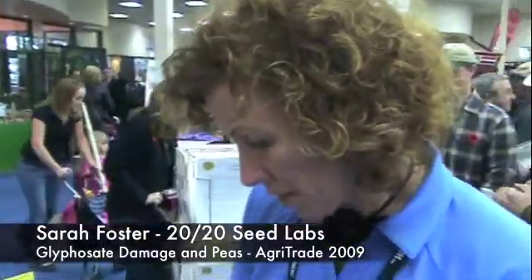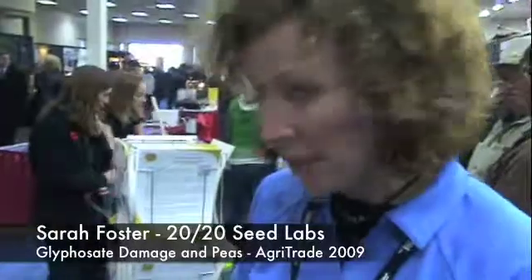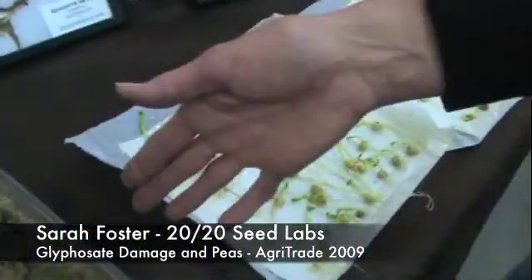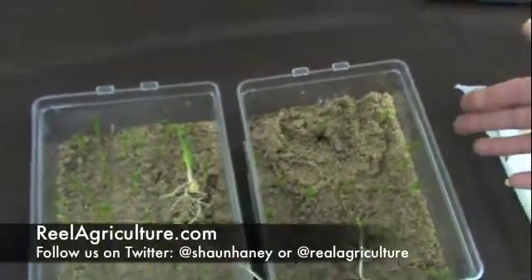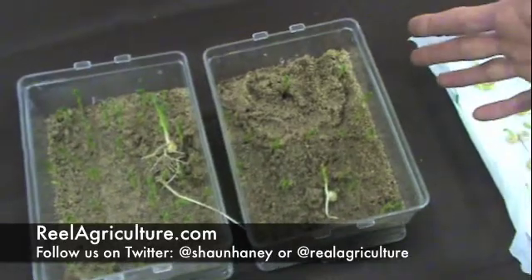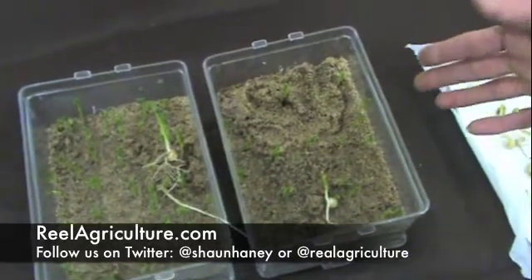Typically what happens is we will test it on paper first — that's a CFIA guideline — and then we go into a sand or soil medium. We actually use soil; that's CFIA regulation. But for demonstrating this, it's easier for us to use a sand base.